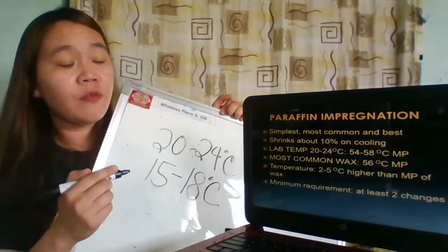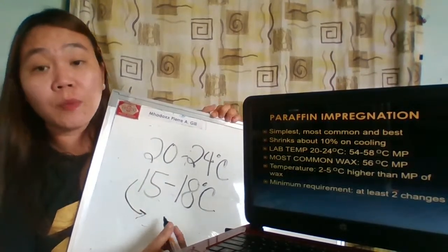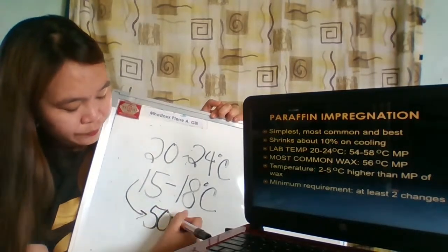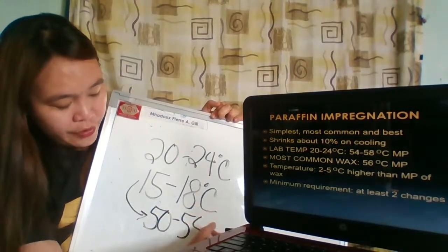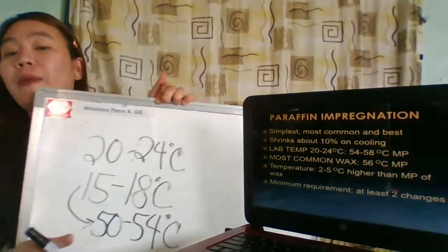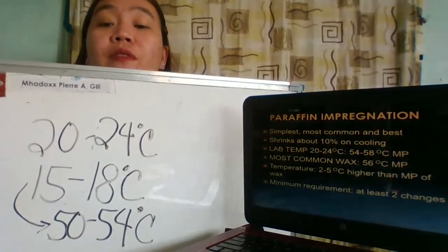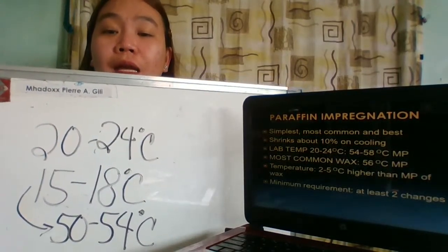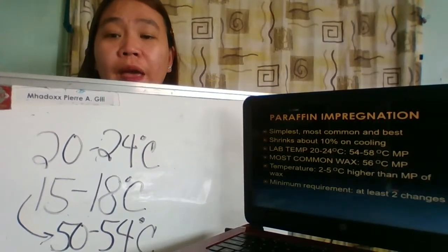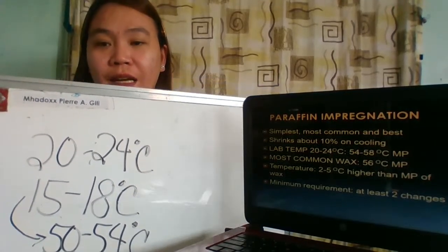Then the wax to be utilized should have a melting point of 50 to 54 degrees Celsius.